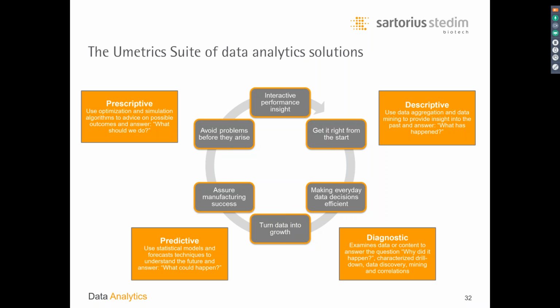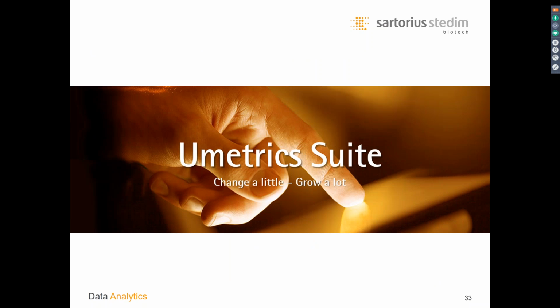And so what these tools do, again, is start from descriptive and diagnostic. In other words, can we describe what happened, understand what happened, and diagnose issues? Then move towards, can we predict issues before they happen? And finally, once we get up to the Control Advisor piece, now we're getting prescriptive. We've matured our models far enough that they can help direct us to what changes we should make in the process to get a desired result. Okay, that's a summary for me.